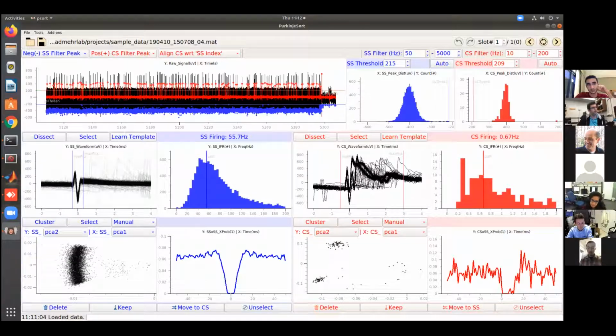The main purpose of this plot is mostly to get a bird's eye view of the whole thing. If you want, you can zoom in, but most of the time you probably don't need to zoom in that much. But as I showed you, you can. So now, going back to the beginning, we just loaded this data set.